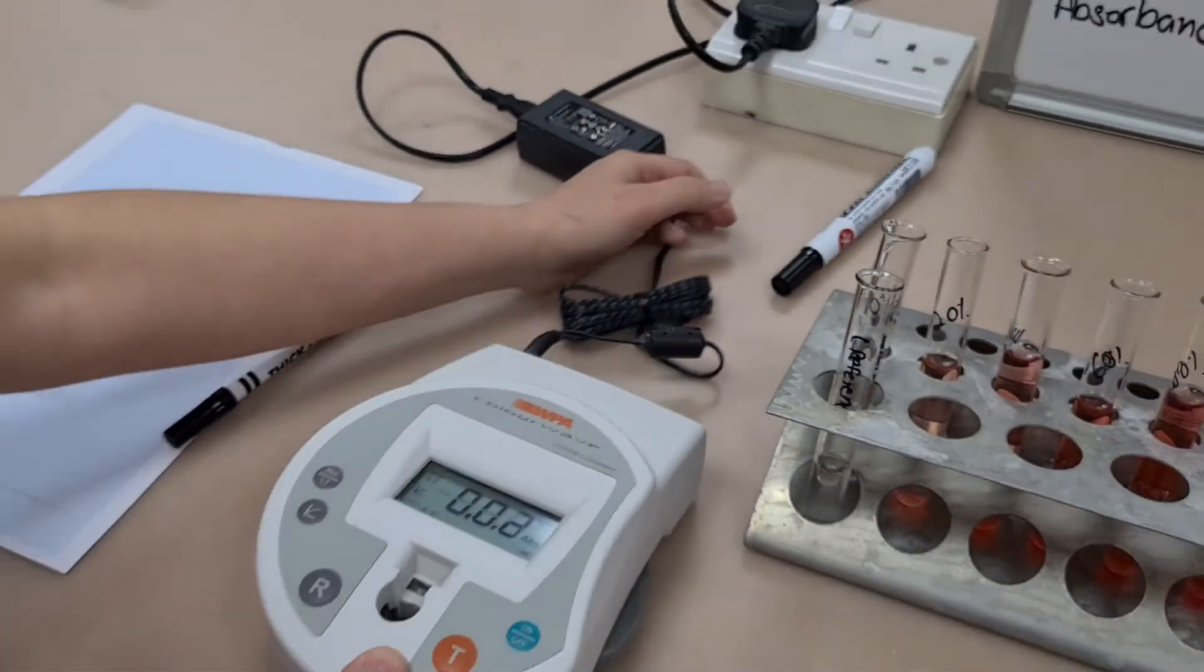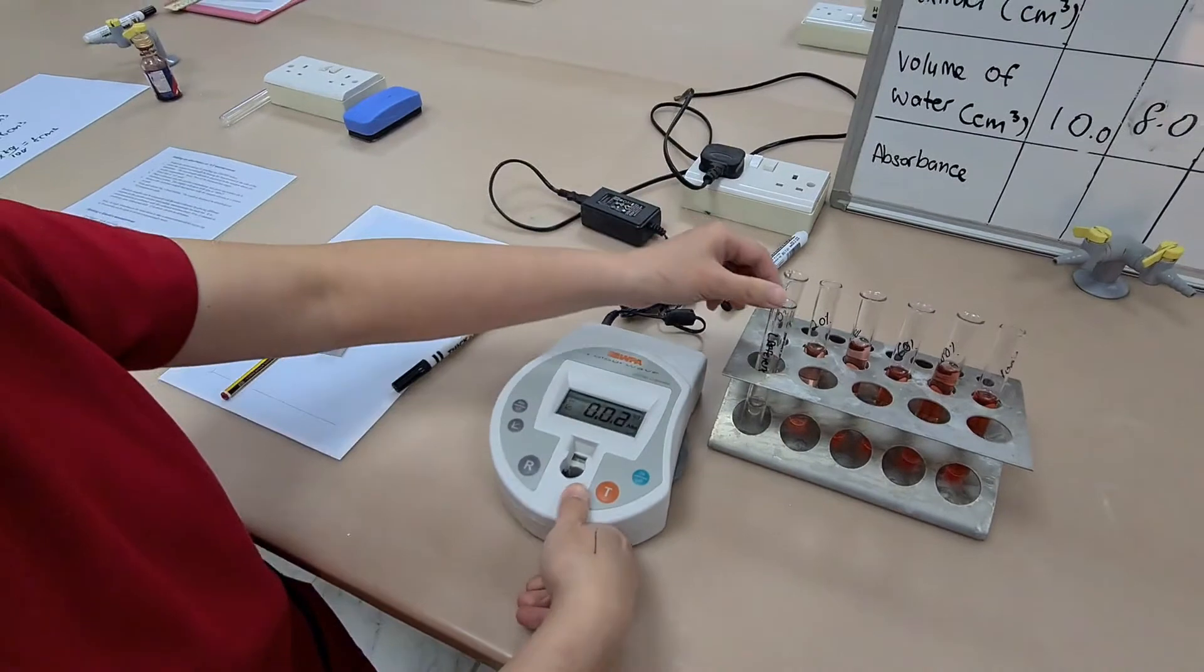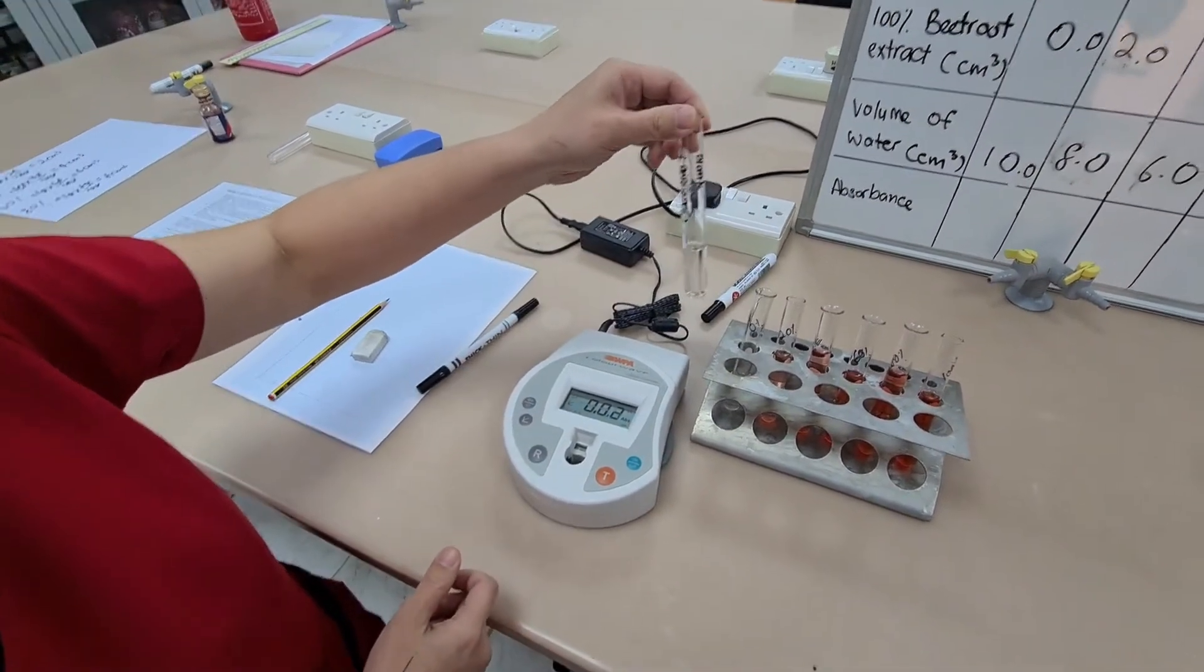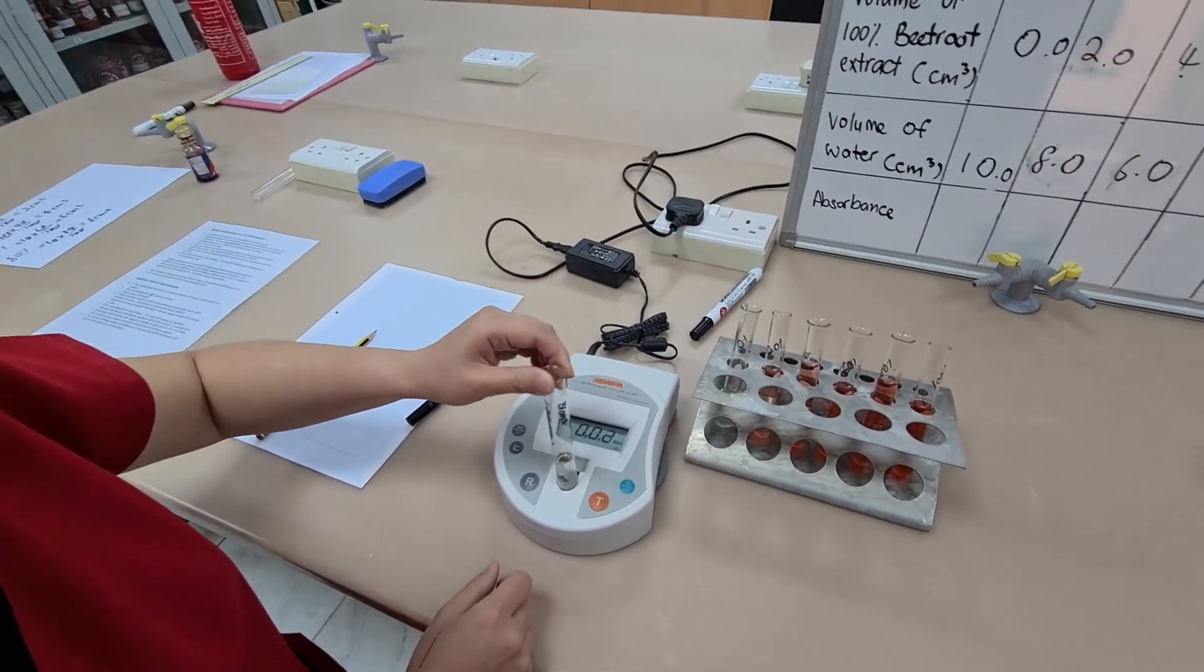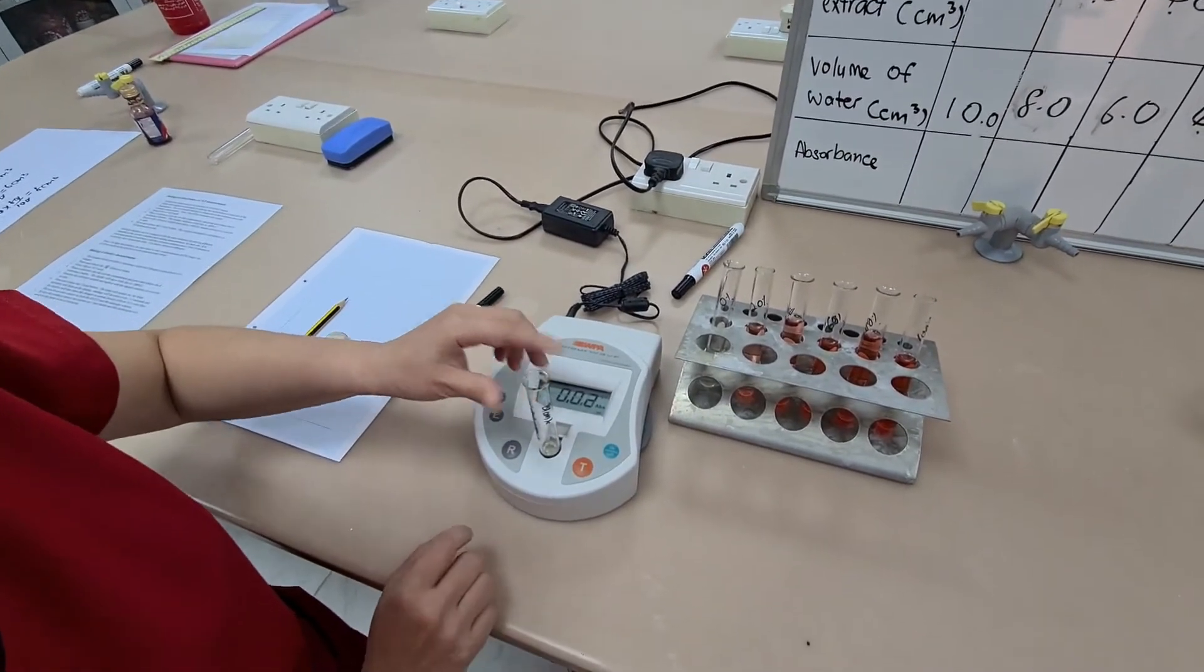In deciding which wavelength to use, the best thing to do is to try a few different samples and ensure you get significantly different results in the range that you're using.